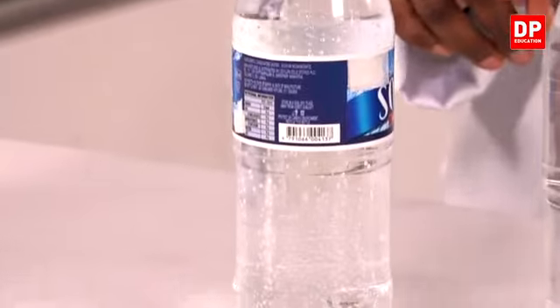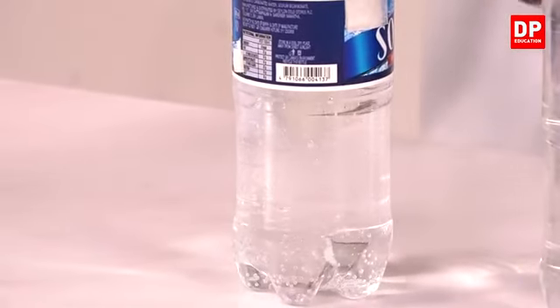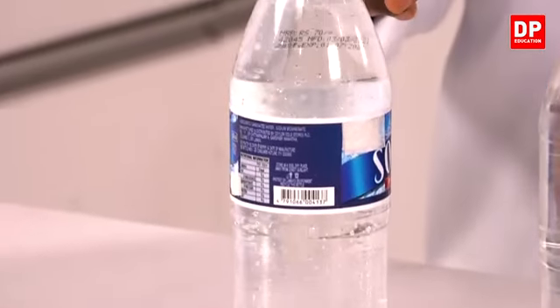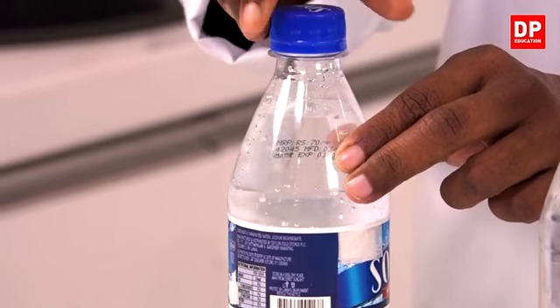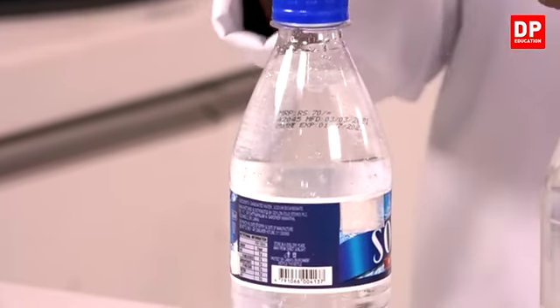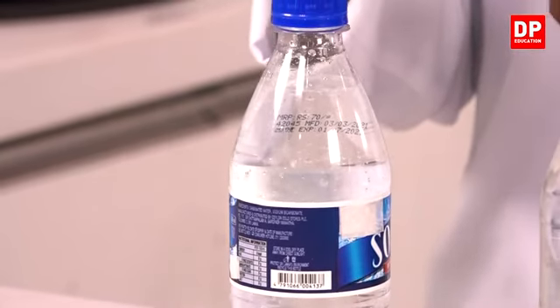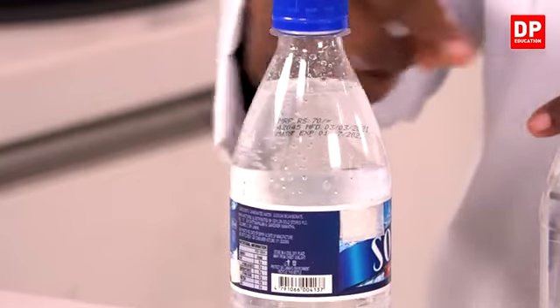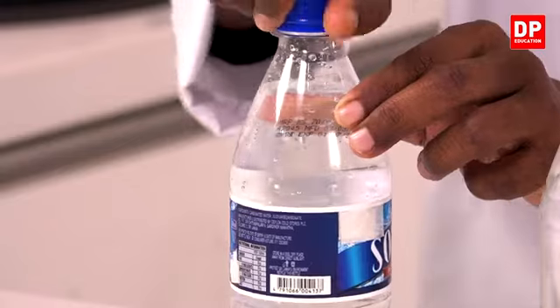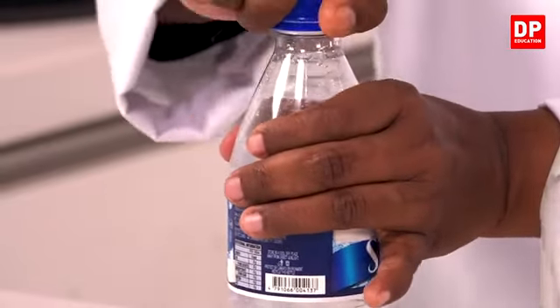So now it becomes a heterogeneous mixture. Why? You can see the gas bubbles coming up. I will open it a little bit more. What happens here when I open the lid? The pressure is released, and because the pressure is released, the solubility of carbon dioxide decreases. Therefore, the dissolved carbon dioxide is being released from the solution. I will open it further.